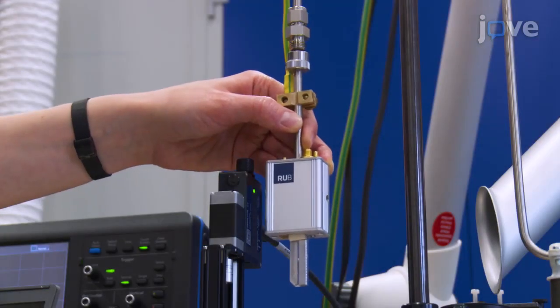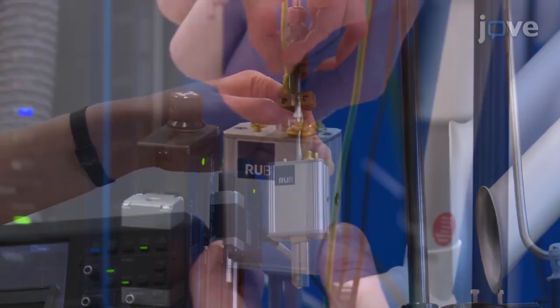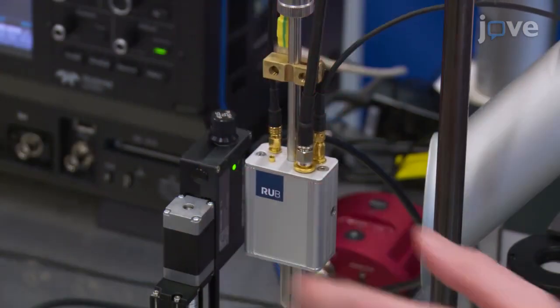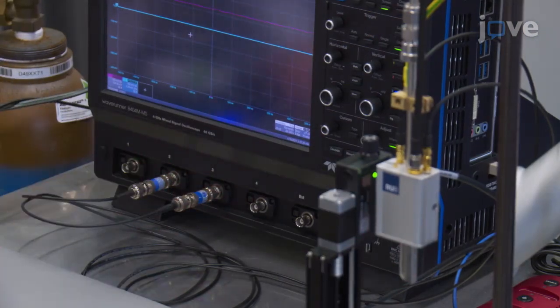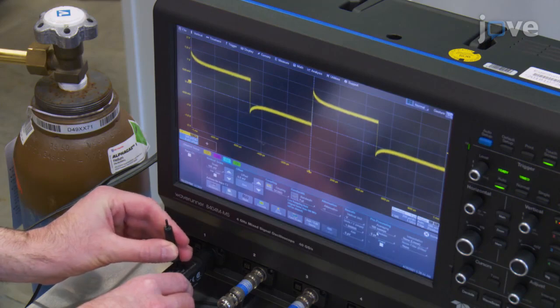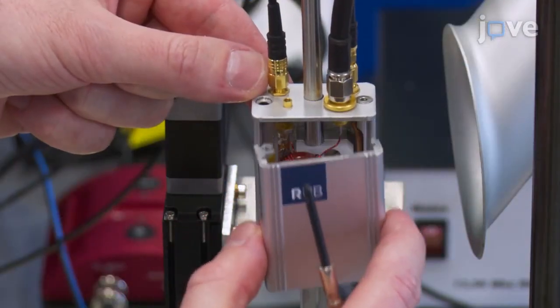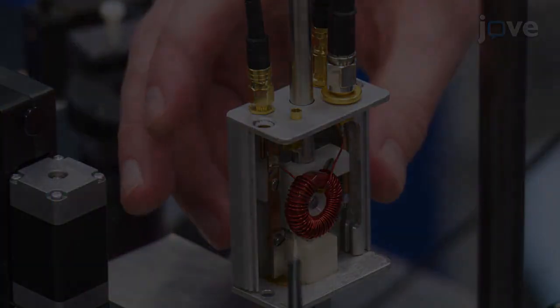Connect the COST jet device to a gas supply and to the power supply. Then connect the integrated electrical probes to an oscilloscope. Properly compensate a commercial voltage probe. Open the COST jet housing by removing 2 of the screws and connect the commercial voltage probe.